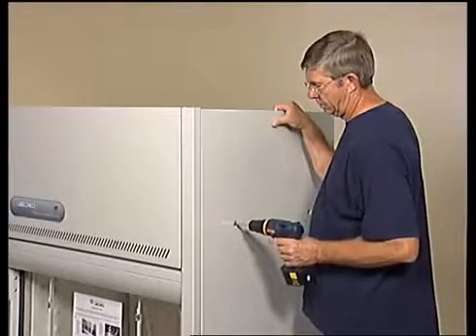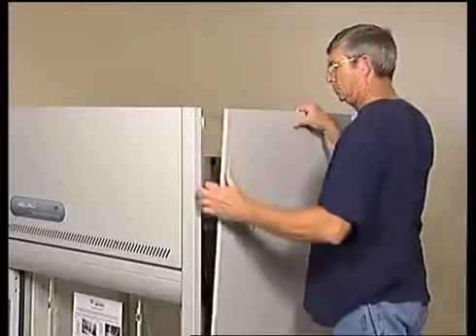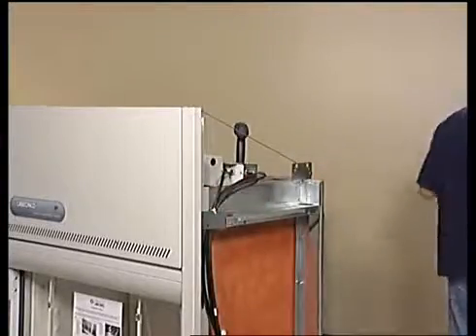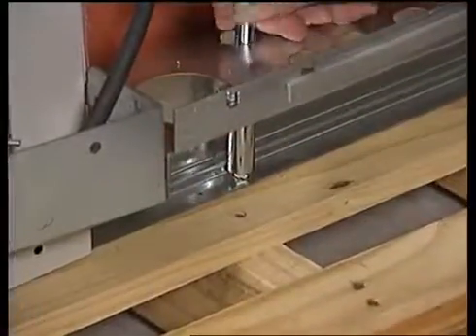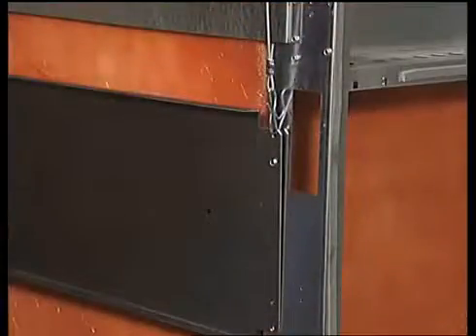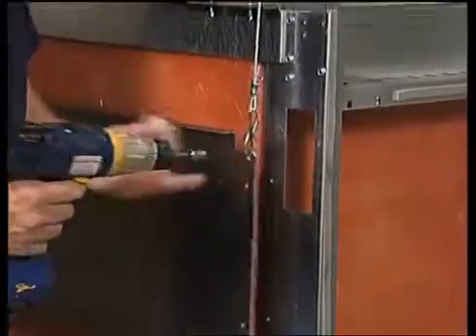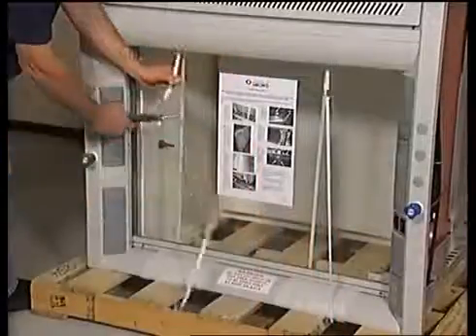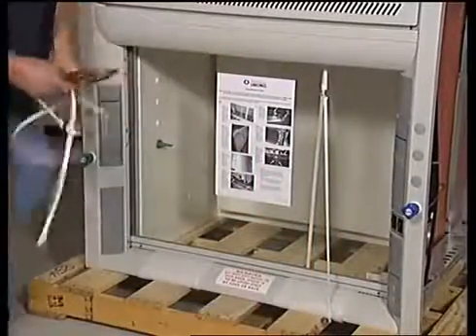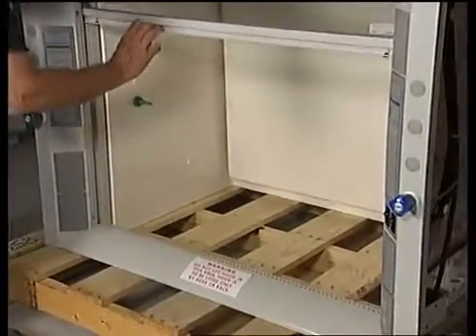Leave the fume hood attached to its shipping skid until it is as close to its final location as possible. Remove both side panels by removing the Phillips screws. Remove the four bolts that secure the fume hood to the skid. To protect the fume hood from damage during shipment, the sash weight has been secured to the back of the fume hood with four screws. Remove the screws and make sure the sash cables are on the pulleys. Remove the two plastic straps that hold the sash in the closed position. Raise and lower the sash to check for smooth operation.